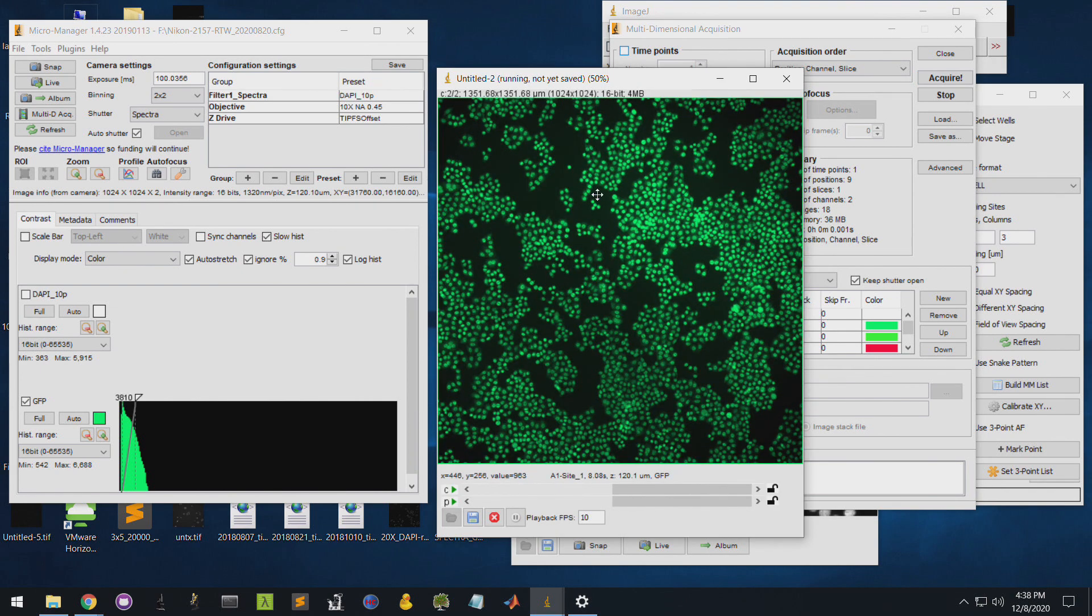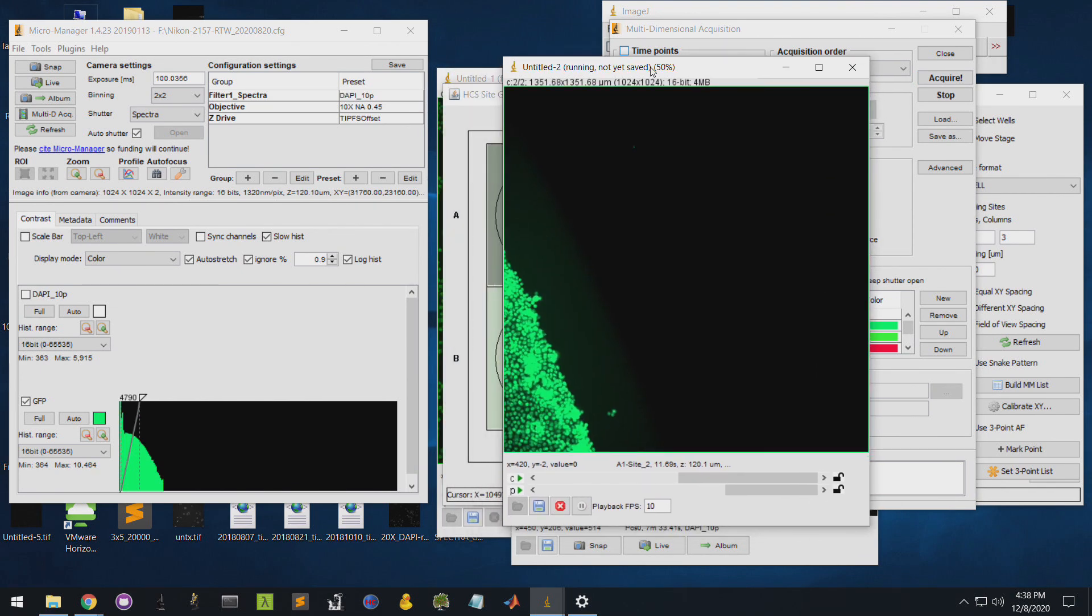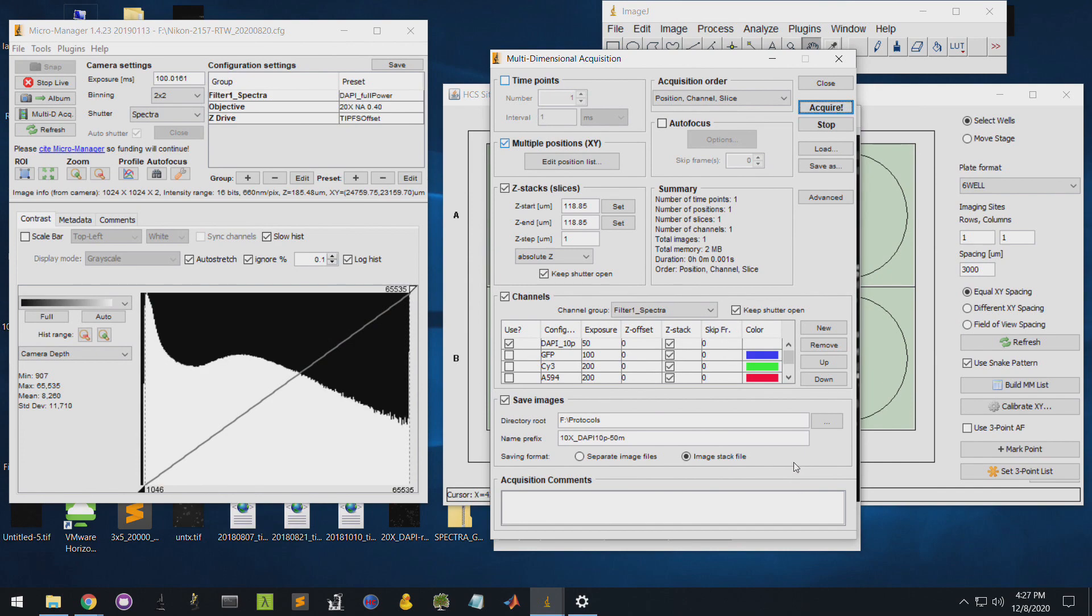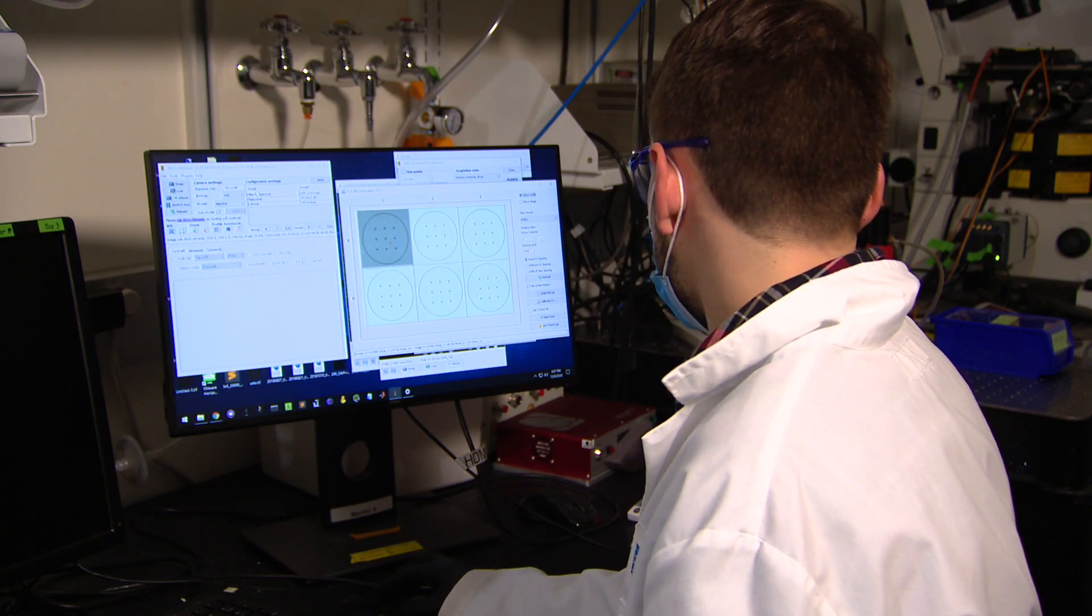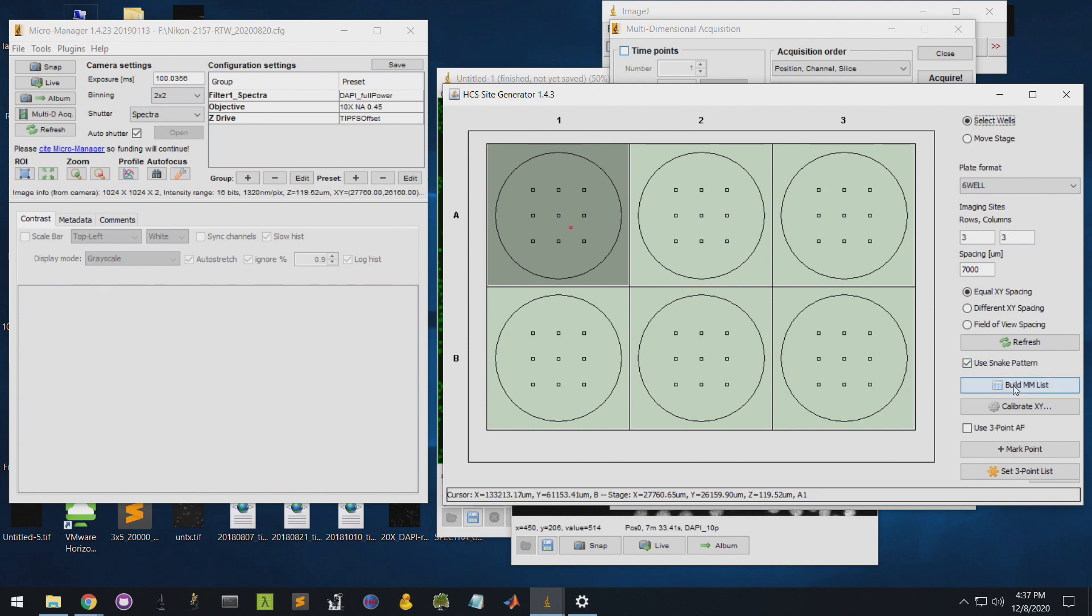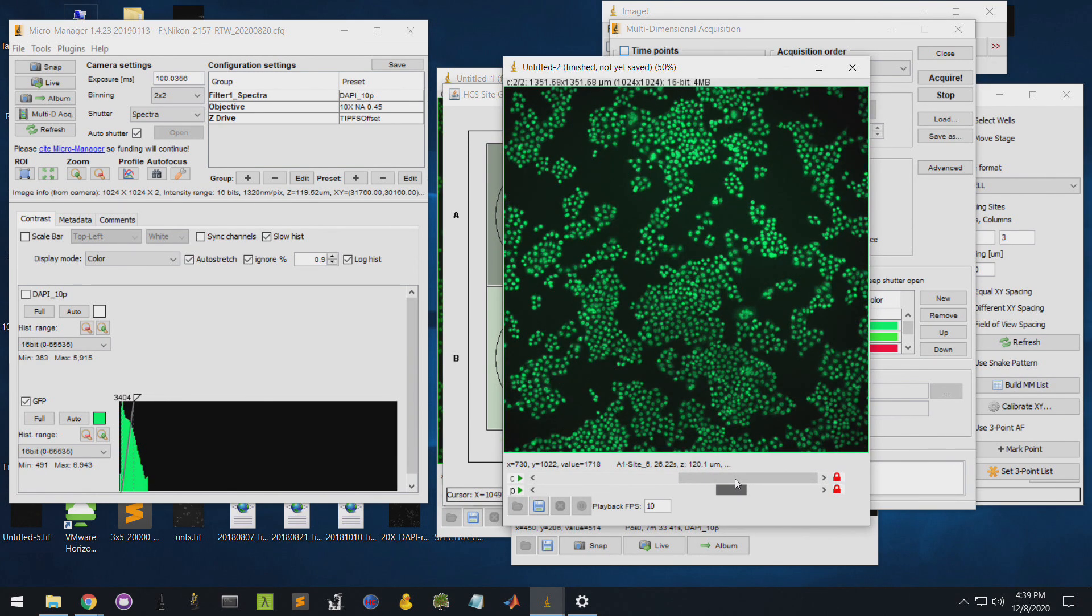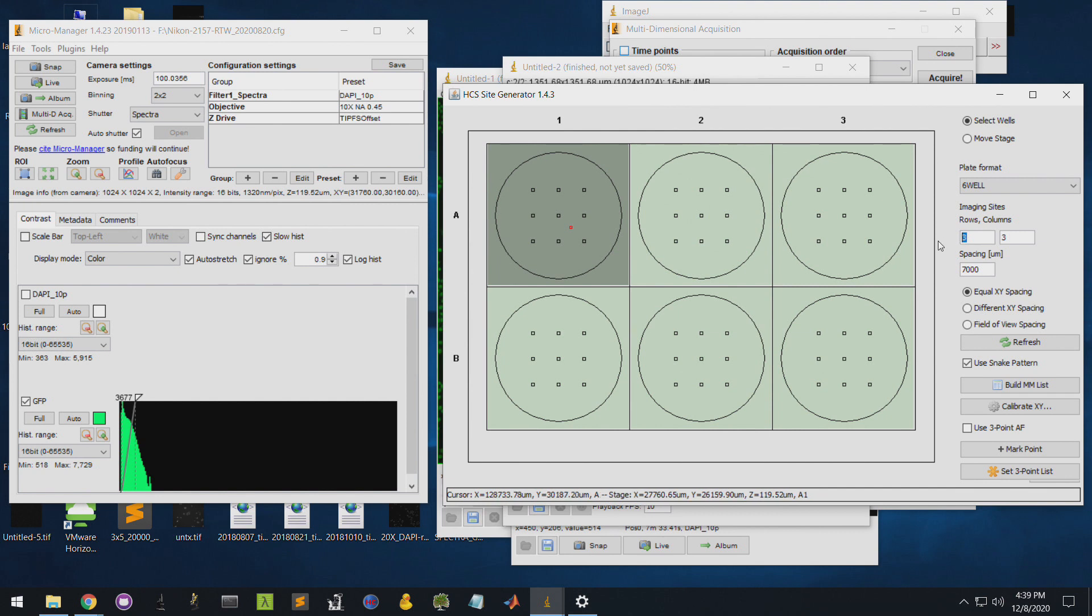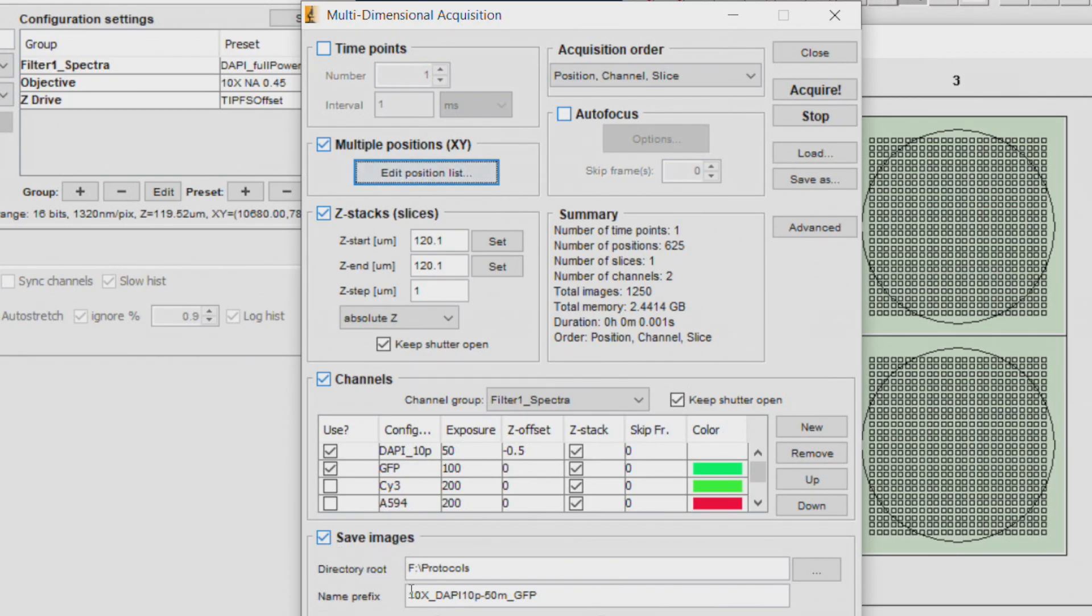Now, load the sample plate, making sure to thoroughly wipe the glass surface with isopropanol and adjust the HCS site generator to the 6-well format. Select the 10x objective and record a DAPI image of the well A1 center to serve as a reference for future alignment steps. Next, acquire data using the Multi-D acquisition module together with the HCS site generator. First, set the exposure times and search for the ideal focal plane in each channel. The Multi-D acquisition module makes it possible to set focus offsets if needed. Next, in the HCS site generator, generate a grid of imaging sites for a test acquisition. Typically, this can be about 9 sites per well arranged in a 3x3 grid to assess data quality.